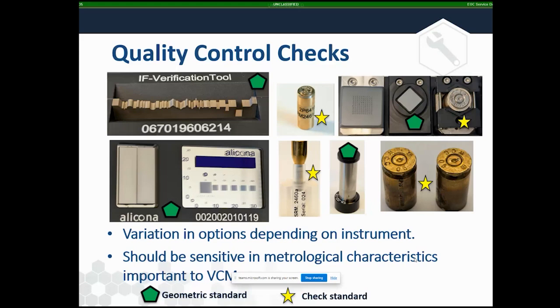At the FBI, we are extremely fortunate to have a huge variety of instrumentation that I've been able to scan, to try different scanning techniques and almost weird things that you get to scan. But at the end of the day, you always want to make sure that your quality control is in order. So there's a variation of options. It's going to depend on your instrument.